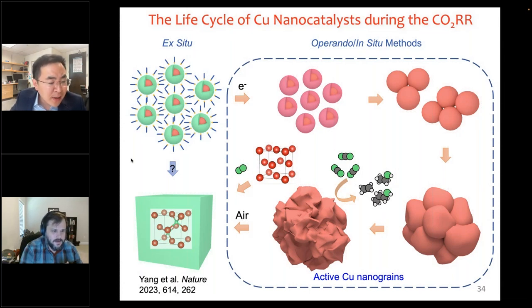Tim, can you clarify, did the person say Nafion? Nafion, yes, sorry. Oh, the sample, the nanoparticles, were deposited on carbon paper, and there we did not use Nafion binder to hold the particles. So there is no polymer binder.